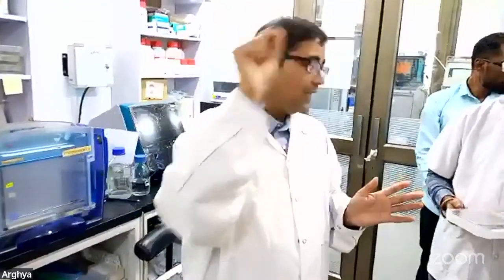Finally, let's say we have got our complex protein separation on the gel, and you found some interesting spots. So you are going to excise those spots and do in-gel digestion of those so that they are digested and you get peptides. And now you're very curious, okay, what that protein is. I have done a few weeks of work from protein extraction, separation on the gel, doing data analysis, identifying the right spots with the images. They are very significant. Now what is that protein?